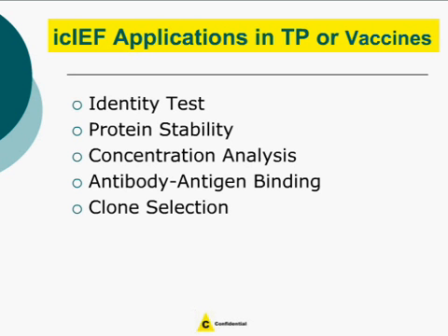In my talk here today, I will be focusing on how we have applied image capillary isoelectric focusing technology in biopharmaceutical development. Specifically, I will be showing some examples of how we have developed methods to confirm product identity, to evaluate product stability with respect to charge heterogeneity, to support clone selection and formulation development, and also how we are able to use an IEF method to determine concentration in process samples, and also to evaluate antibody-antigen binding.